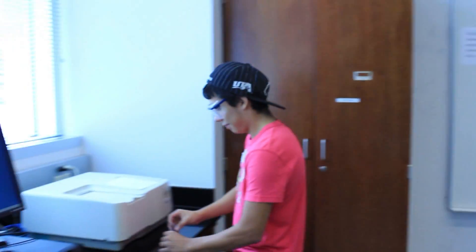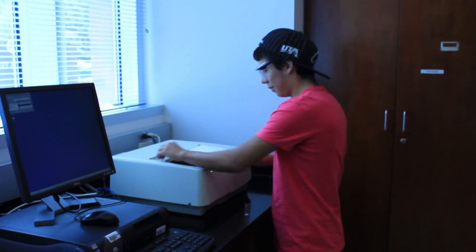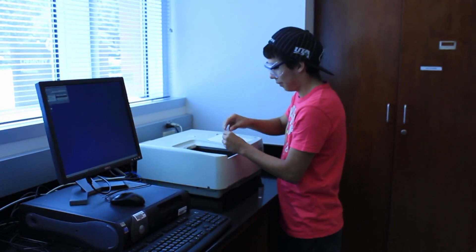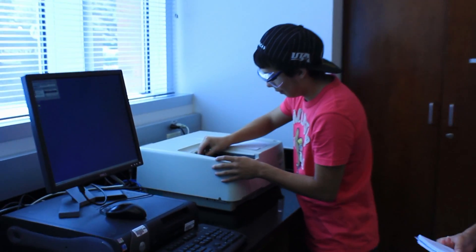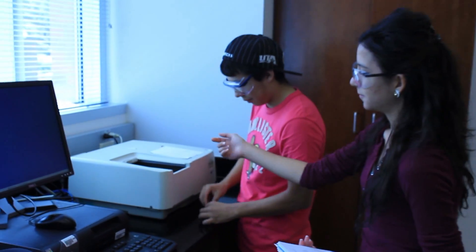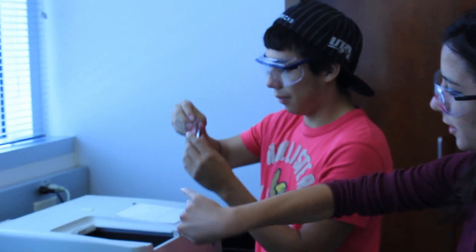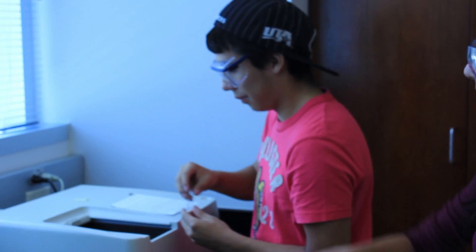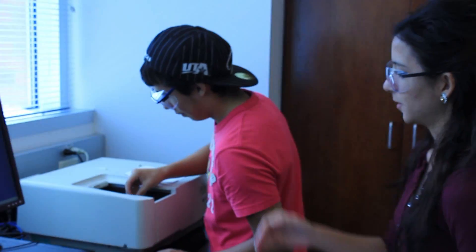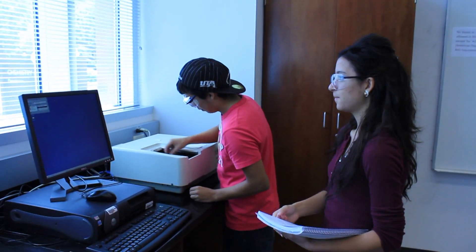For the second part of this lab you'll start working with the spectrophotometer and you'll need to auto zero the machine. So you'll put in 2 cuvettes filled with distilled water and you want to make sure that the clear side is facing this way so the machine can read through it.